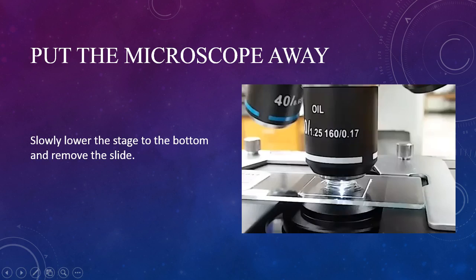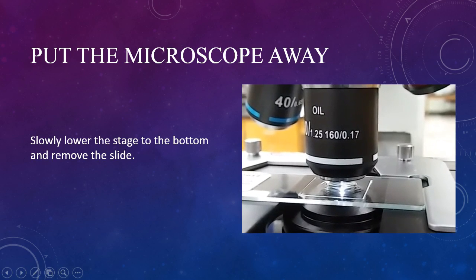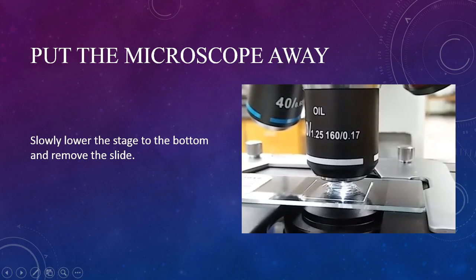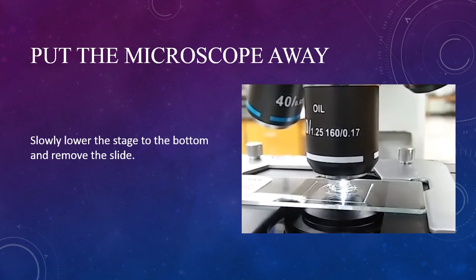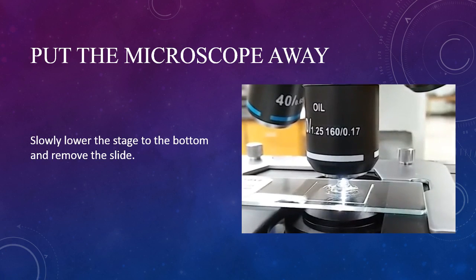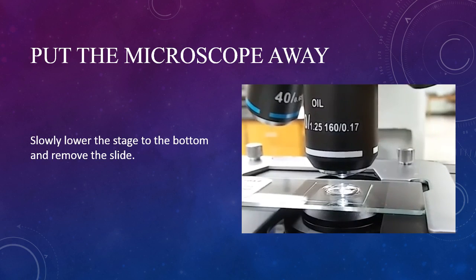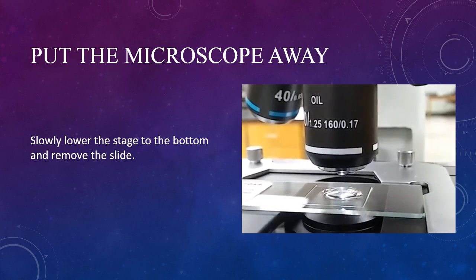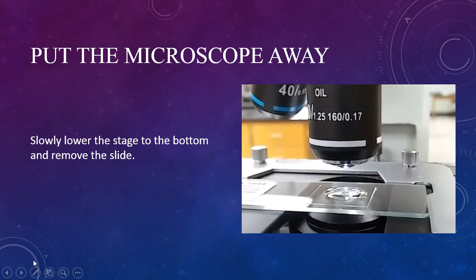You'll notice in the video how the oil looks like a tube of light connecting the lens and the slide. Once the stage is down, remove the slide, clean it, and put it away.